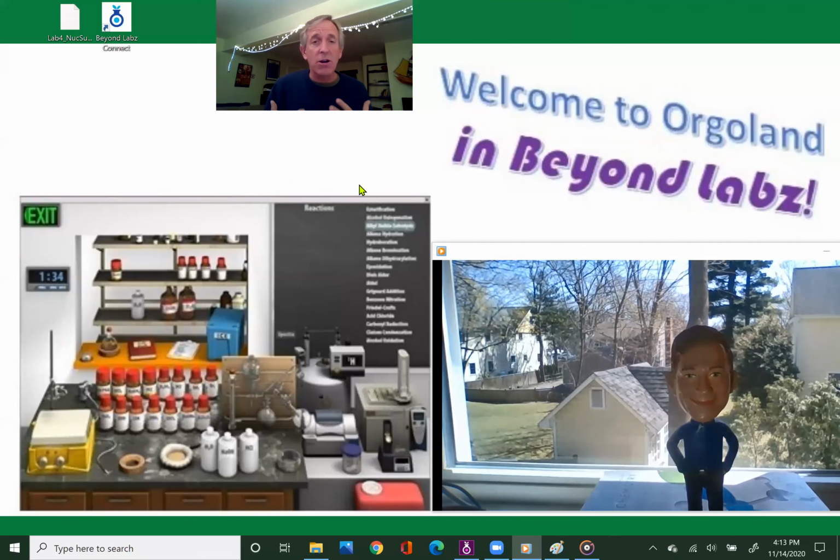What I really want to start off with is to give high praise to Beyond Labs, because it is the first software that I have seen that mimics what takes place in an Orgo lab as close as possible from a virtual point of view. It even allows you to make decisions about what you want to do, and I love programs that allow you to make the decisions. So what I want to do is show you a sample synthesis on how to actually create a synthesis. But again, if you want to know what the glassware is for and what the techniques are, please see our appendix in our Google site.